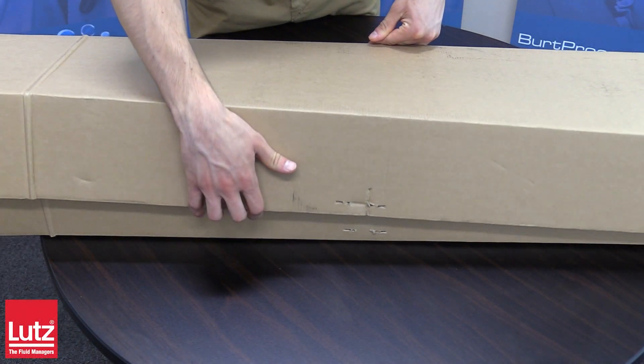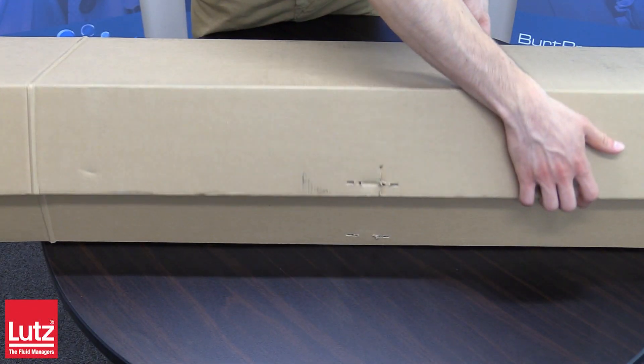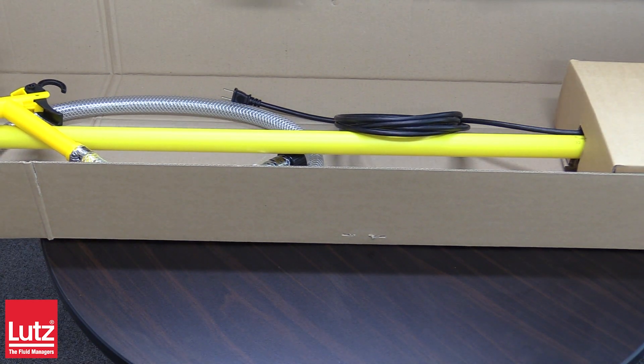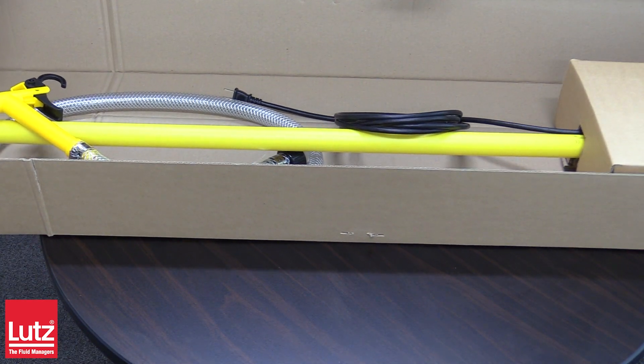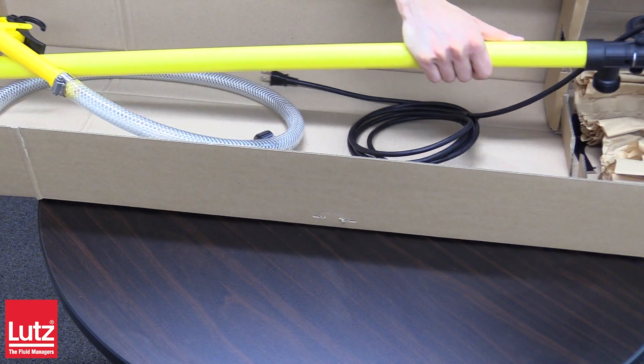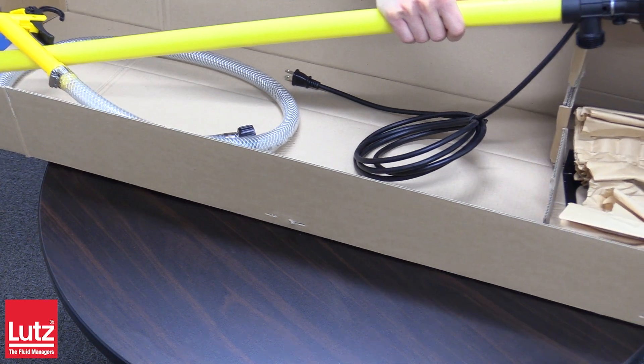The Lutz brand stands for fluid handling using drum and container pumps. In 1954, the company founder Karl Lutz started making electrical drum and container pumps in Wertheim, Germany.